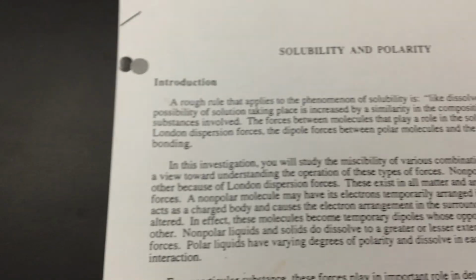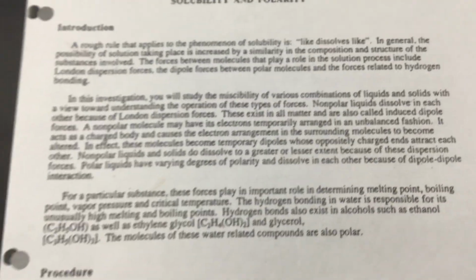We're doing the Solubility and Polarity Lab. We do not need to measure things exactly. This is a qualitative lab, so 1 pinky's width will suffice for 1 milliliter. And we're going to begin with water.